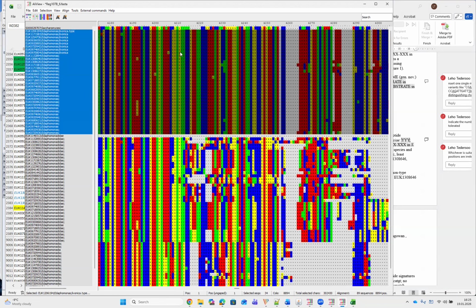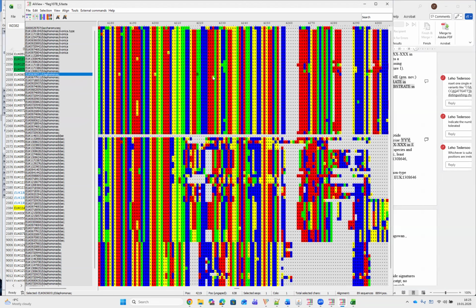So we have here also some variability, which may be true or not. We can't judge. So preferably we leave it out, but if we see what the distance is, it's exactly 19 nucleotides, and if we want to stick to our 20, we should include one of those erratic positions.